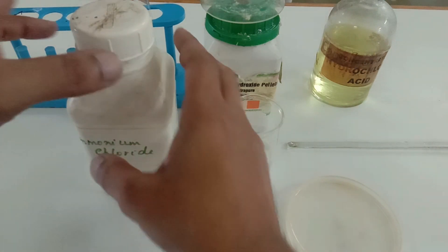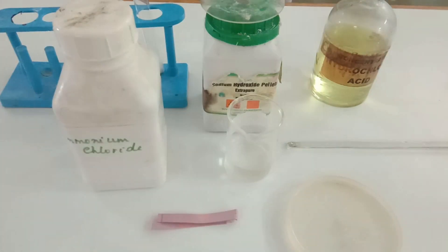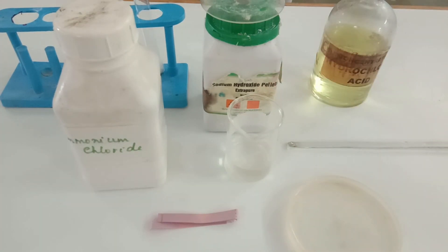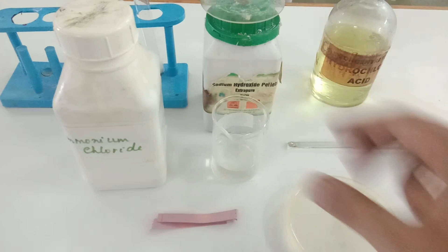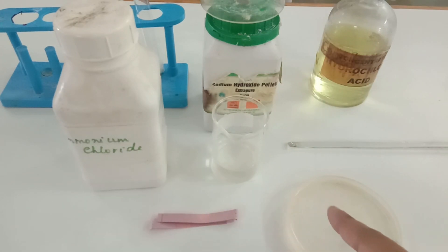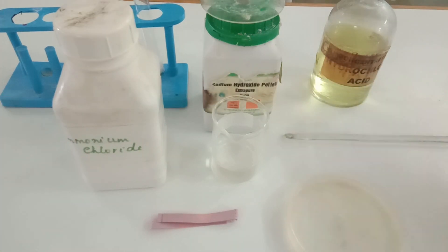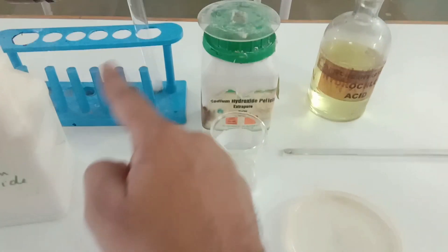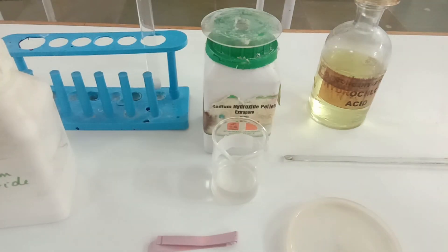Ammonium chloride salt is white in color. I also have sodium hydroxide pellets — small tablets — but unfortunately due to the temperature in the lab, it got converted into liquid, so I am going to use liquid sodium hydroxide. Other materials include a red litmus paper, distilled water in a petri dish, a glass rod, concentrated hydrochloric acid, test tubes, a test tube stand, and a test tube holder. I have already taken ammonium chloride salt in a test tube.